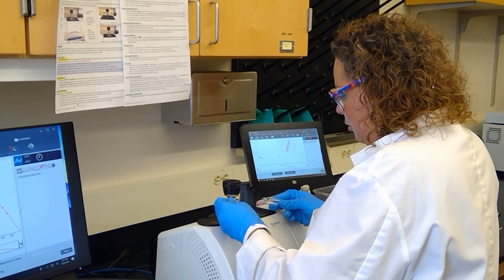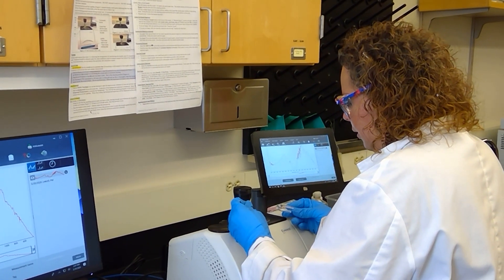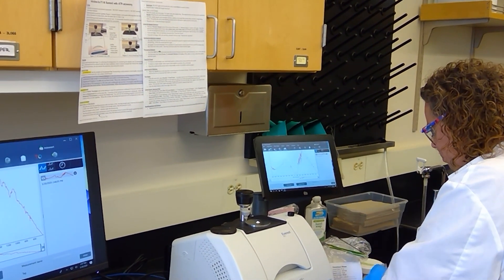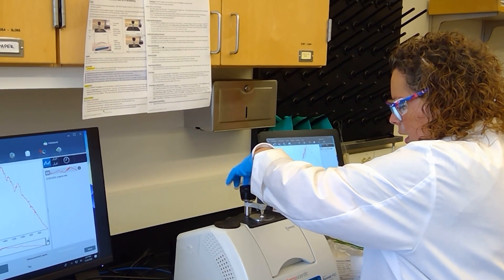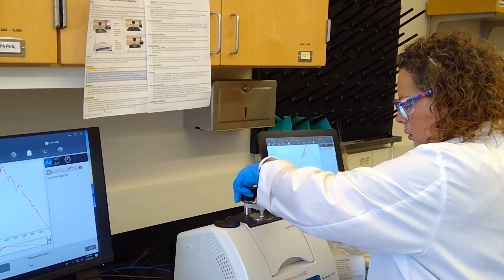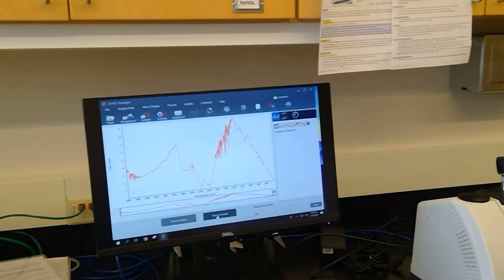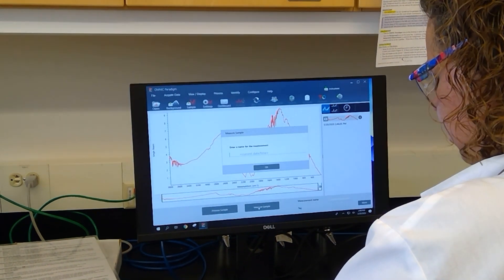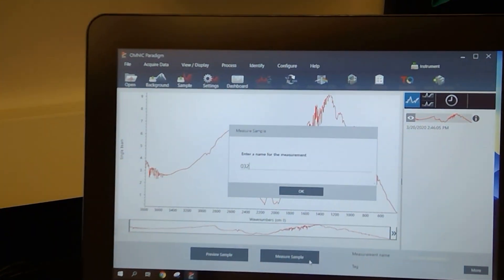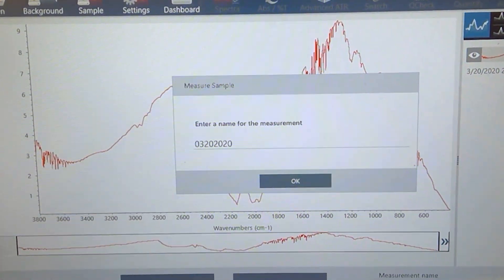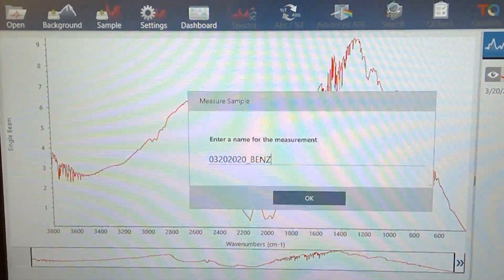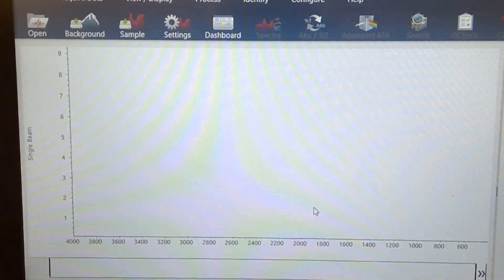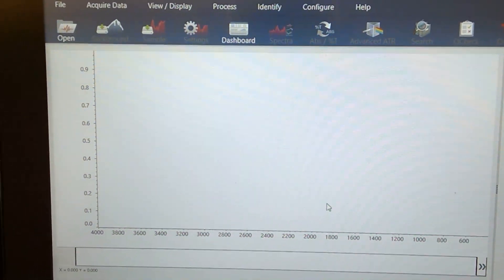Using some of the sample on the infrared machine so that we can test our sample and see how well we did in terms of the experiment. So the goal here is to see now an alcohol group for the benzhydrol, since we have reduced the benzophenone. We're going to go ahead and measure the sample, and let me take off my gloves so I can type here.